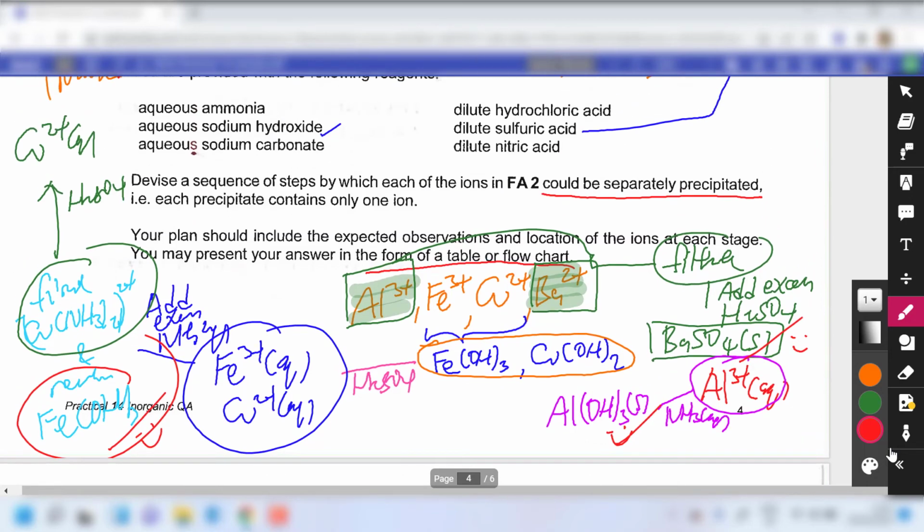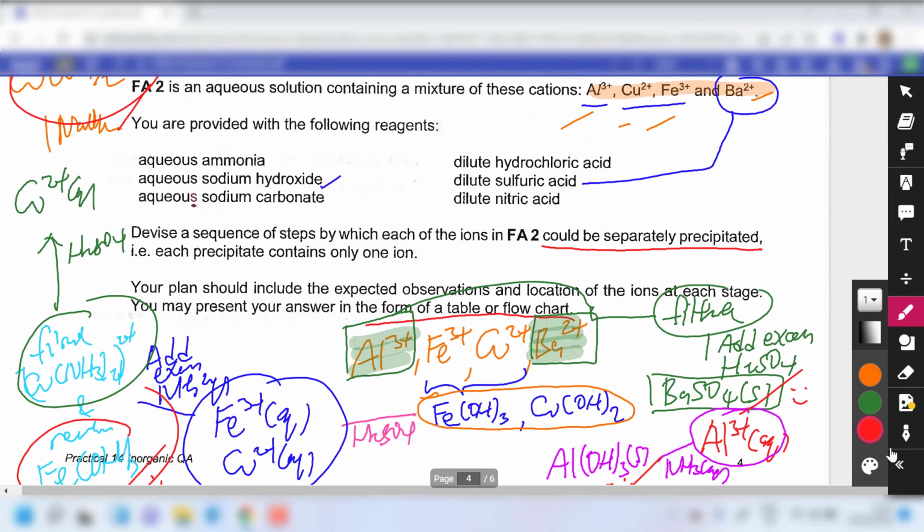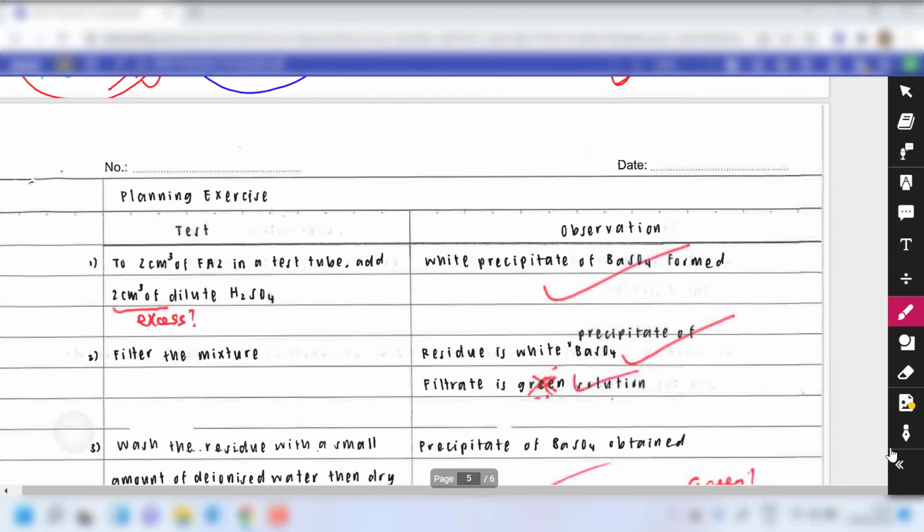So this is the broad thought process which you might want to look at in performing such planning. Of course, all roads lead to Rome. You don't really need to separate them in pairs, and then within each pair separate them out. So what I'm going to show you is one sample done by one of your classmates, and then we'll take a look at how we can benefit from this.